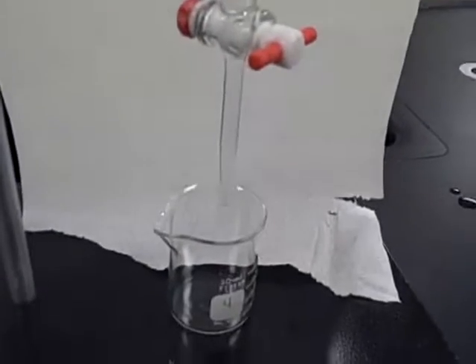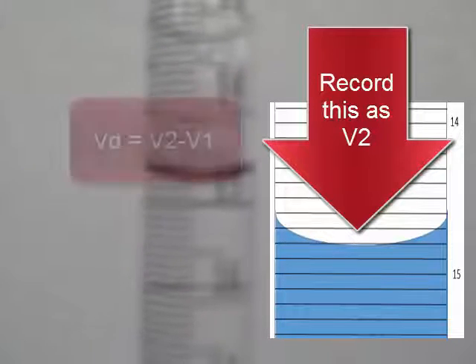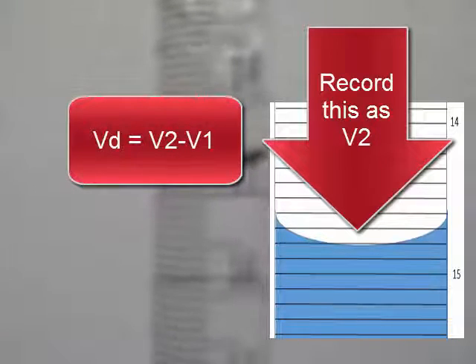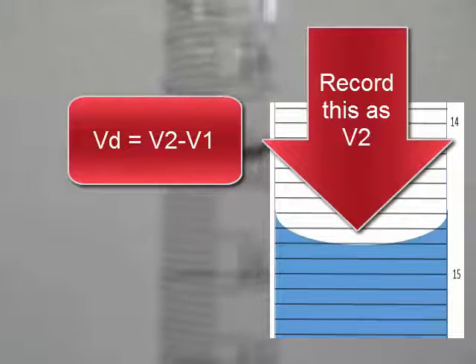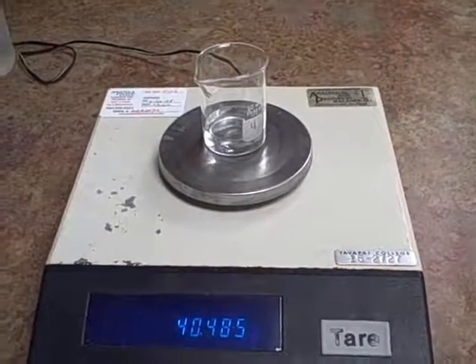Now I'm going to dispense approximately 10 milliliters into the small beaker, which is now resting below the burette tip. Now accurately record V2. Use V2 and V1 to determine the volume dispensed. Now record the weight of the beaker and the sample of the salt water from the burette.